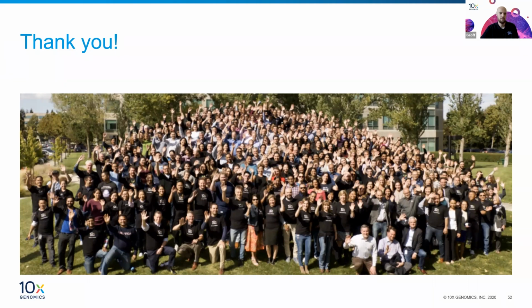So I think it probably would have been in the single cell, Chromium single cell realm. You can do upfront staining of cells and FACS sorting, those kind of things. As long as your cells are already in single cell suspension, you could do some sort of microscopy. But out of our platform, you're basically just detecting any polyadenylated species. Because we do actually sequence the transcript, we do at a high level gene counting, is the transcript present or absent? But you do have the sequence of the transcript there. So if you need to pull out something specific that's in the sequence of the mRNA molecules, detecting, say, SNPs or something like that, that's possible, and there's certainly a whole body of literature and algorithms written to do that.